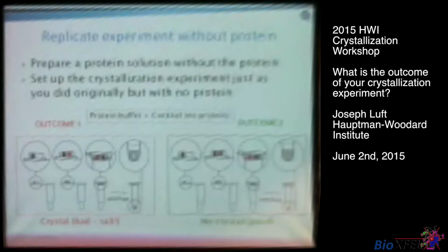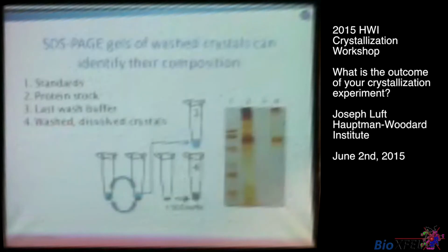But that said, there have been many cases I've seen where the protein is actually required to crystallize the salt. The protein's holding on to water too. It's got other things with it, and sometimes you'll get the salt crystals to form only when the protein is present, which is kind of mind-blowing.